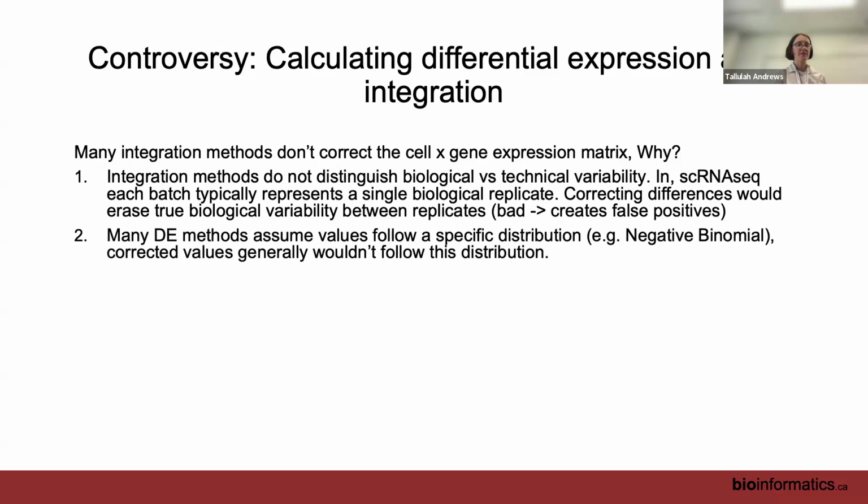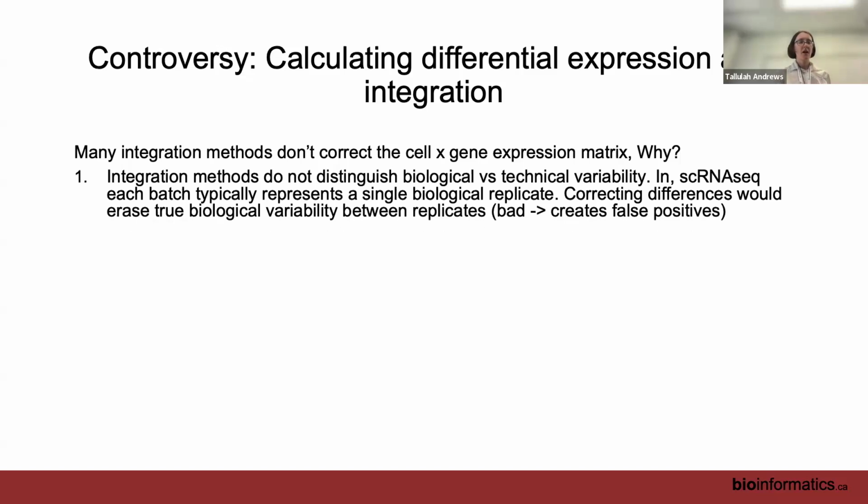As a result, for the most part, integration methods in single-cell RNA-seq do not correct the gene expression values deliberately, because they don't want people to start doing differential expression on the corrected counts and getting false positives.